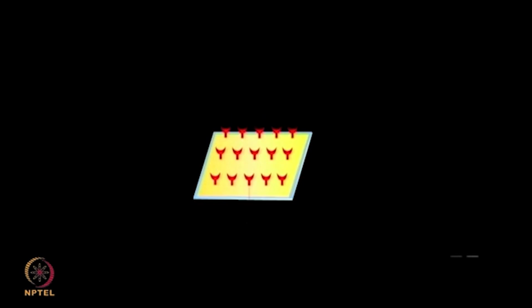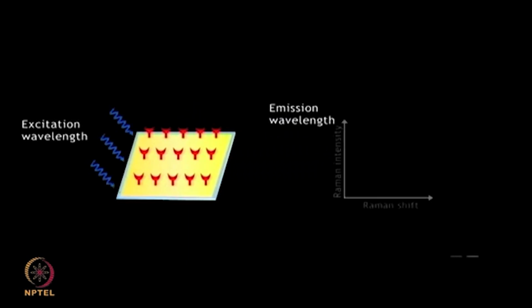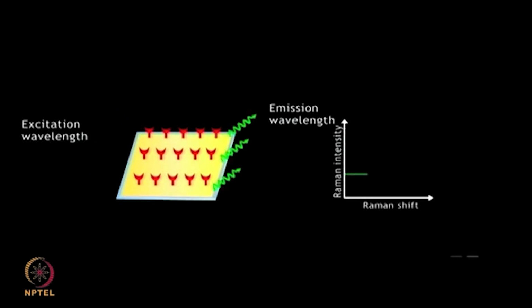Let us now discuss the principle of gold nanoparticles and nano cages in this interactive animation. The gold nanoparticle surface is functionalized suitably by antibodies which will bind to the analyte of interest. Any target binding is depicted by a change in the emission spectra.